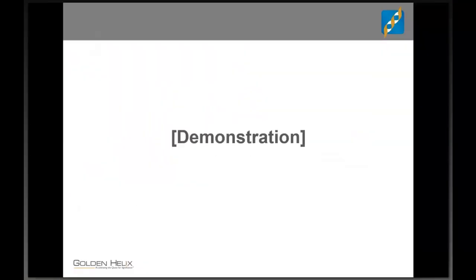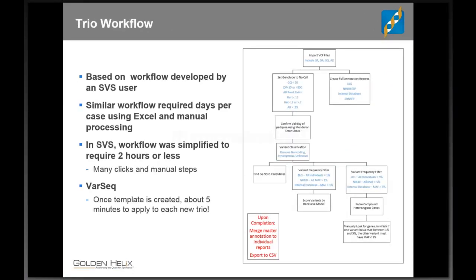So let's move on now and talk about exome sequencing and Varseq. So we just finished a demonstration based on gene panels where you kind of know what you're looking for. Every gene on the gene panel is there for a reason.